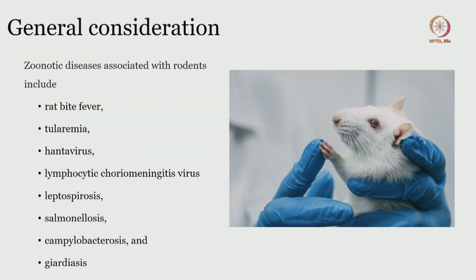So today we will look at what precautions need to be followed, how a sterile field is maintained, how sterile clothing is worn, and how it is really maintained throughout the procedure, throughout your stay within the lab. So let's look at those aspects in today's session.